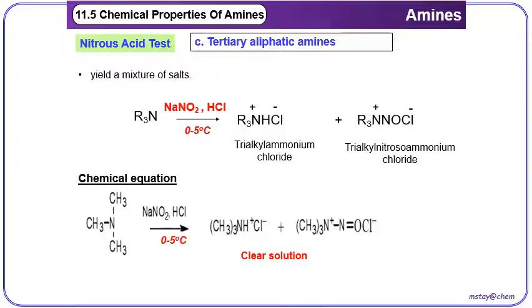Before we proceed with tertiary aliphatic amine, just now for the primary aliphatic amine, we were able to see the bubbles of gas. For the secondary amine, we will get a yellowish oil. So now we will proceed to the tertiary amine.